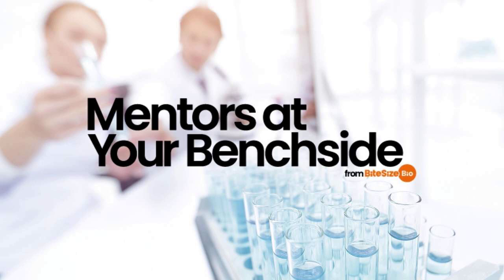Now that you know a bit more about the fixatives available, here are several tips to put them to good use. Do things in the correct order. The order in which you stain and fix may vary depending on the biological question being asked. Sometimes, if surface and intracellular epitopes are to be examined, it's best to stain surface antigens first and then fix them. But beware, some fluorochromes are sensitive to fixation. Fluorochromes such as phycoerythrin or PE or allophycoerythrin APC are large protein molecules and will be affected the same way as other proteins by fixation, so try to avoid alcohols. Small fluorochromes such as Alexa Fluor 488 or FITC are generally unaffected by whichever fixative is being used.